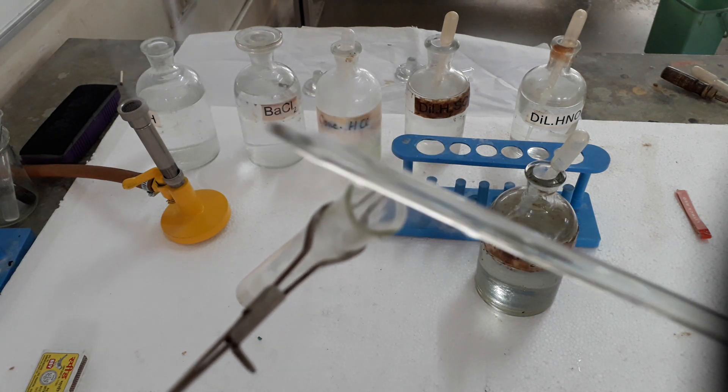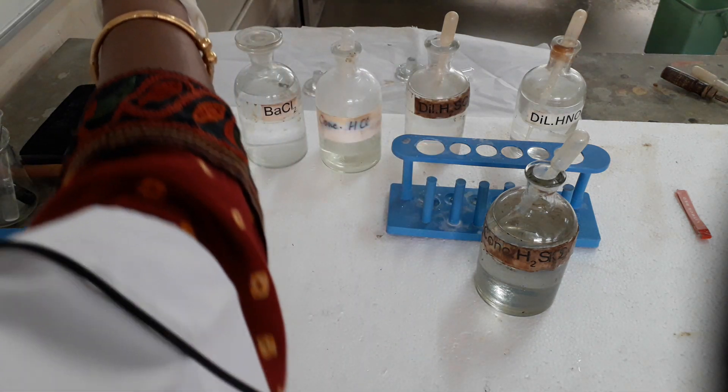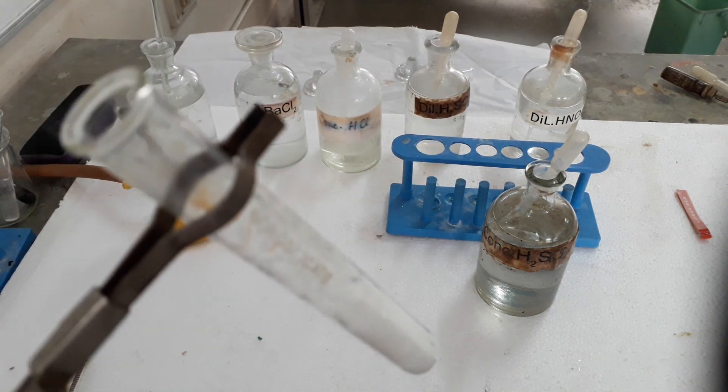So this confirms that the gas is hydrogen chloride which is coming out from the test tube, and these dense white fumes are of ammonium chloride. Thank you students.